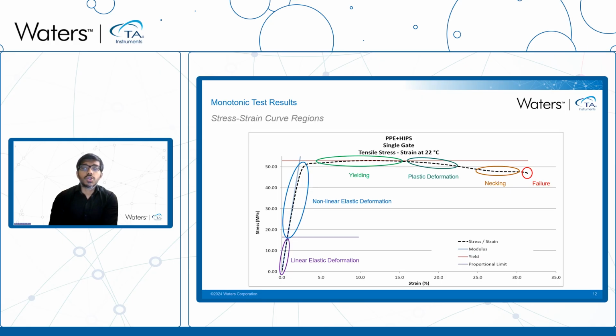The tensile test also provides indication of fatigue and creep response to characterize long-term performance of the material. For example, generally a lower tensile strength usually indicates degraded fatigue performance. These tests are performed in this investigation as well. We have characterized our material performing creep and fatigue tests, and we'll share the results in the subsequent slides.